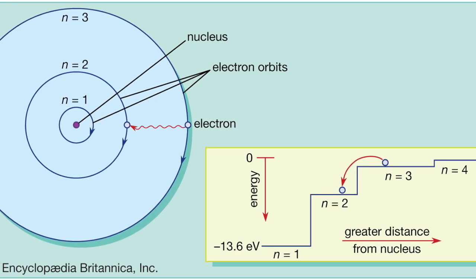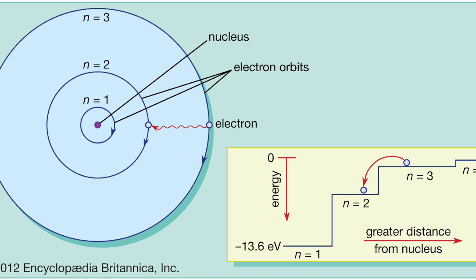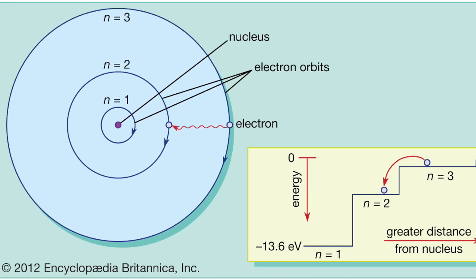The Bohr model describes electrons in set values in a series of circular orbits. So the energy lost by an electron and the abrupt transition between energy levels is the same as the energy of a quantum of light emitted. In 1917, Einstein came up with the concept of stimulated emission, which is fundamental for the function of a laser.